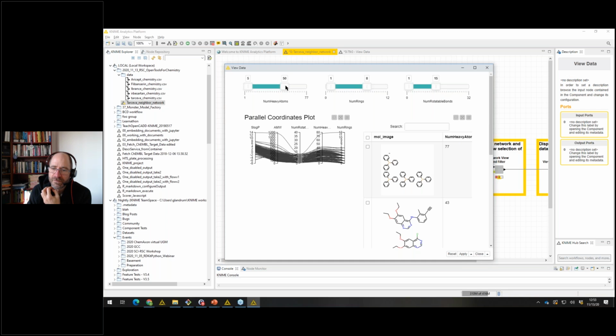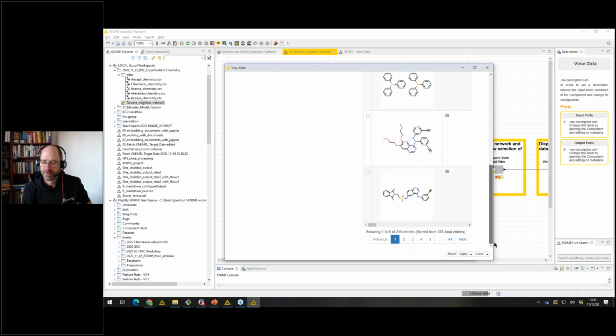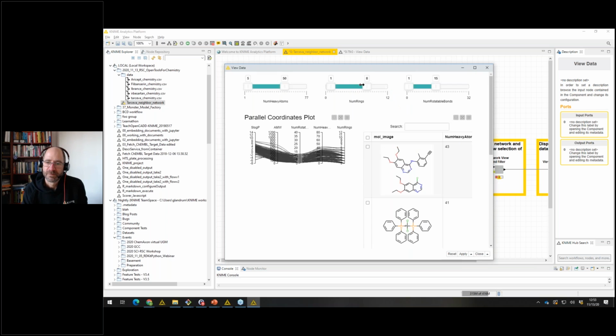It's interesting. Oh yeah, the table hasn't updated, that's actually somewhat strange. I would have expected the table to... okay, I need to change it in order for the table to update. So at this point, this should now be, okay, there's 219. Let me finish updating these. This is a bug, I apologize for this.